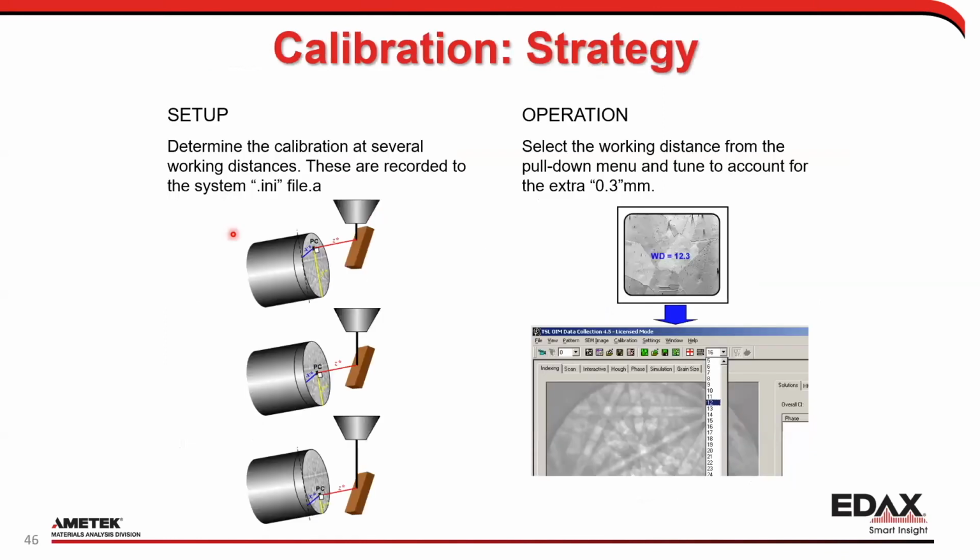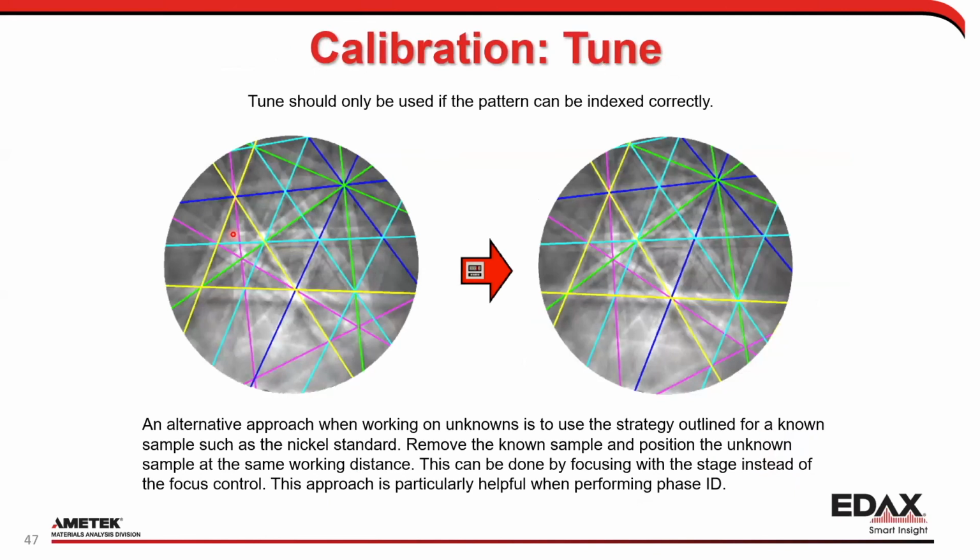Really, honestly, the main thing that works with this is the calibration itself, which you shouldn't have to worry about. The only real time I play around with calibrations is if I have a really big sample, my detector's not all the way in, or something's wonky in general. As a general user, again, you don't have to worry about calibrations.